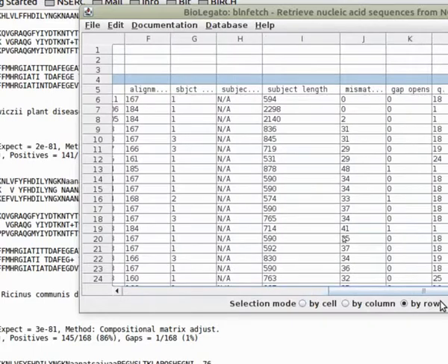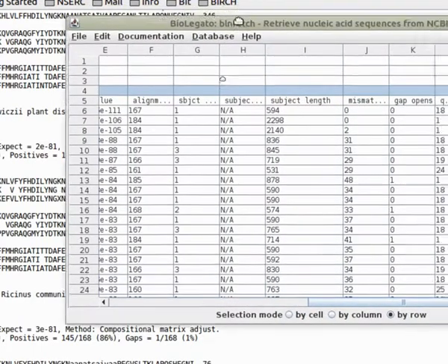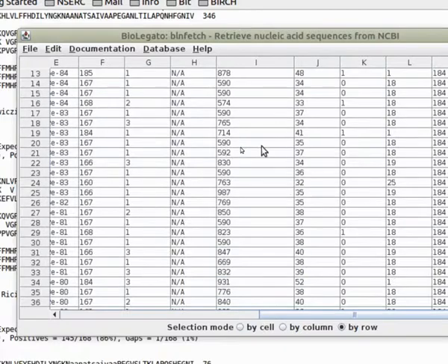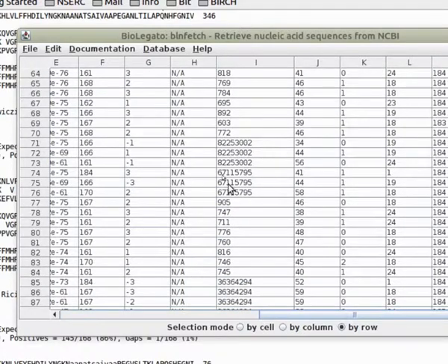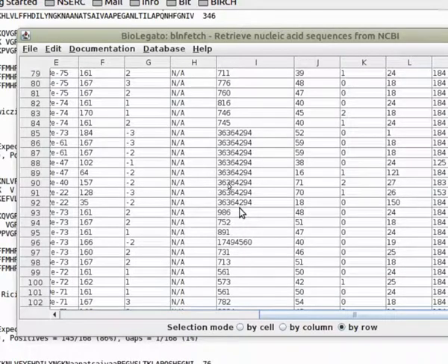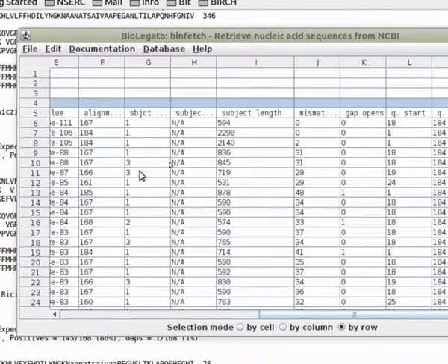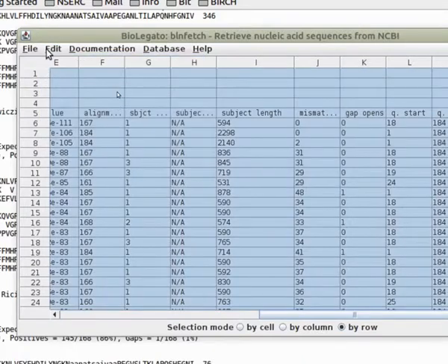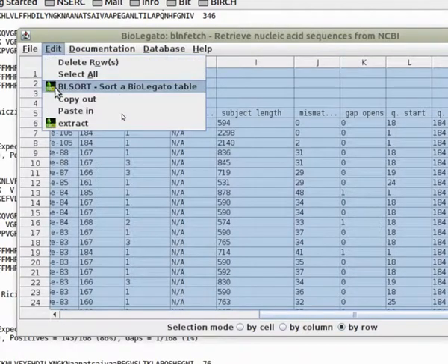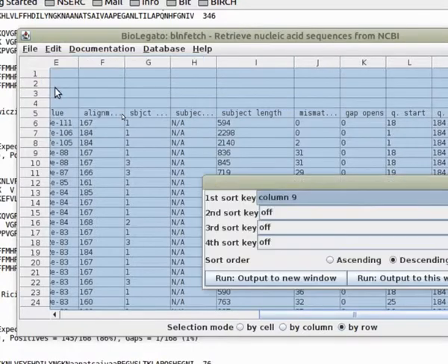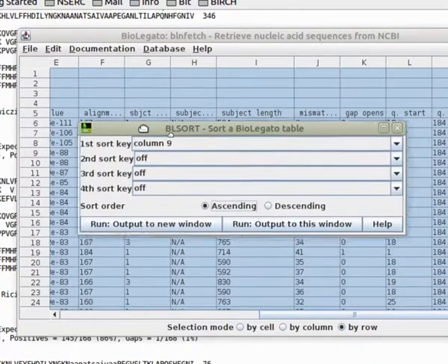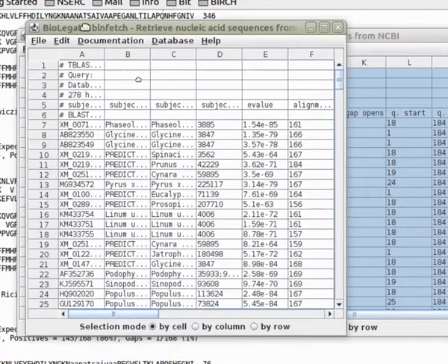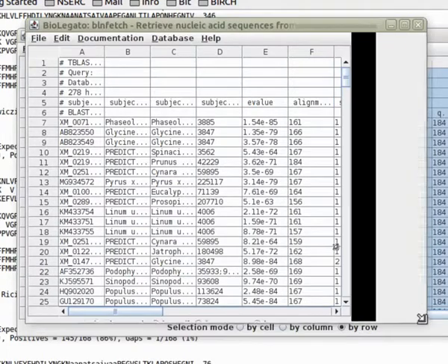One of the important fields is the subject length. The reason this field is important is that a lot of times we only want to retrieve gene-sized features. If you look down this list, you'll see there are quite a few sequences that are probably BAC clones or chromosome fragments that would make it a little more complicated to work with. So what we're going to do is sort this entire table on the basis of the ninth column, column I, which is size. We'll go for an ascending sort, and then we'll get a new window with all of the same sequences but now sorted by size.